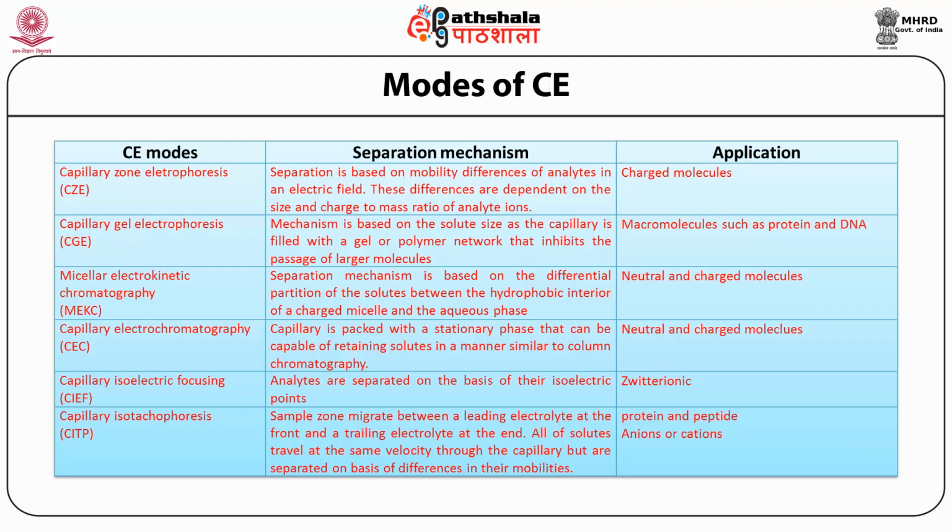The third one is micellar electrokinetic chromatography, known as MEKC, and the separation mechanism is based on the differential partition of the solutes between the hydrophobic interior of the charged micelles and the aqueous phase. This can be used for separating neutral and charged molecules.